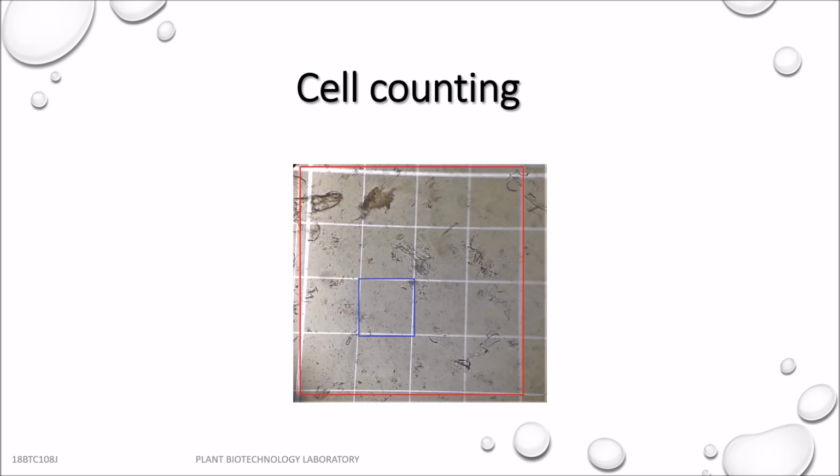It is essential to maintain maximum cell density in the suspension culture for an effective productive process. Direct cell counting under microscope is one simple method of estimating the cell density in the suspension culture. It gives a reliable count on the number of actively dividing viable cells in the culture.